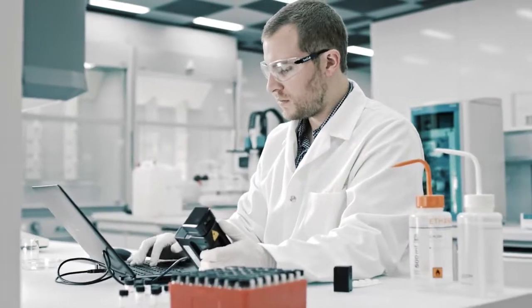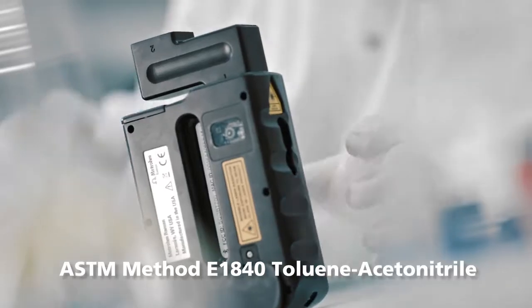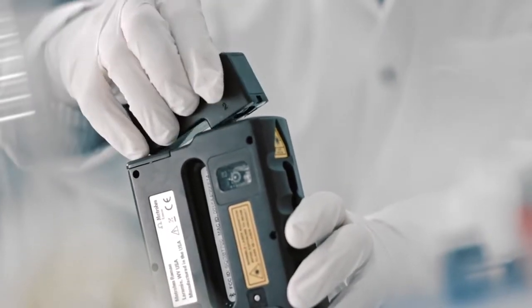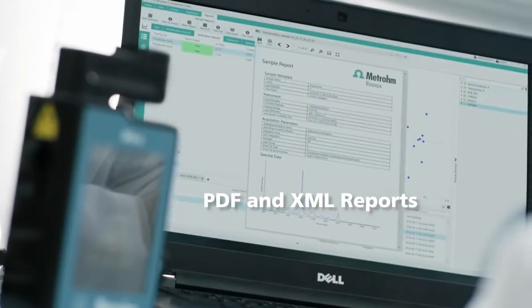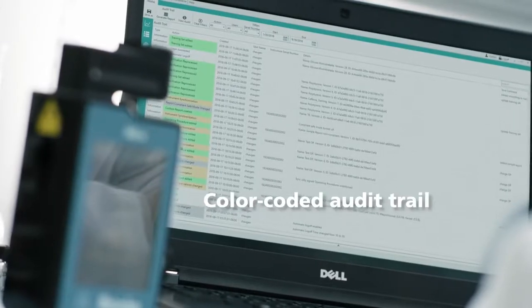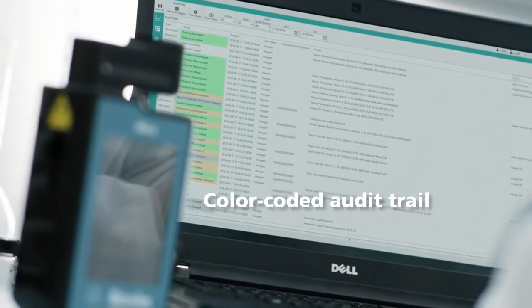MiraP provides you with the compliance you require, and the software is designed around your daily routine. Our new calibration standard follows USP and EP guidelines. PDF and XML reports are automatically generated on every synchronization. The color-coded audit trail gives you peace of mind every step along the way.